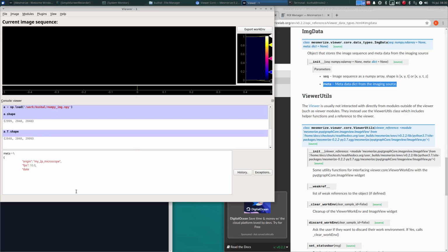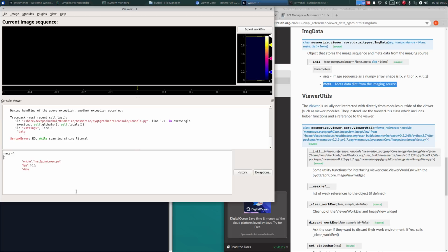Let's see. Date. And this has to be entered in basically year, month, day, and then hour, minute, second format. So I'll just do something for that now.